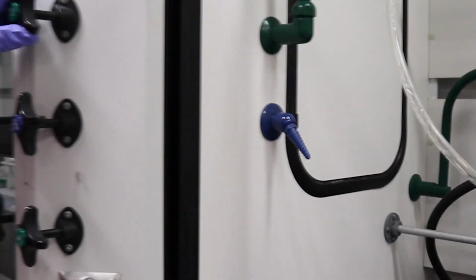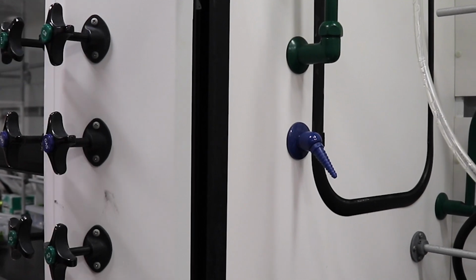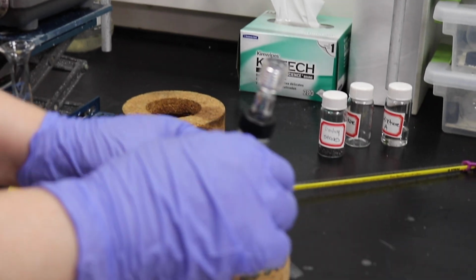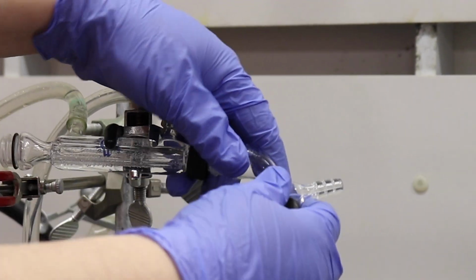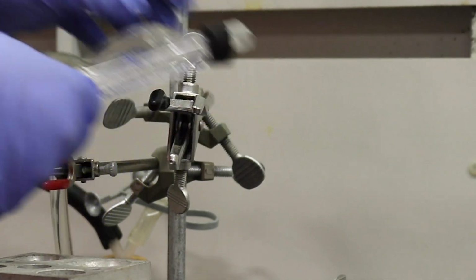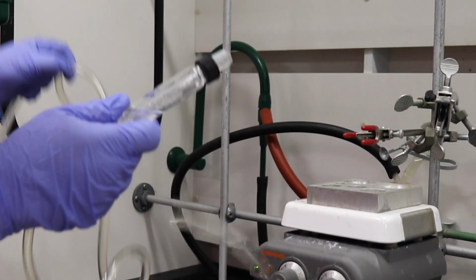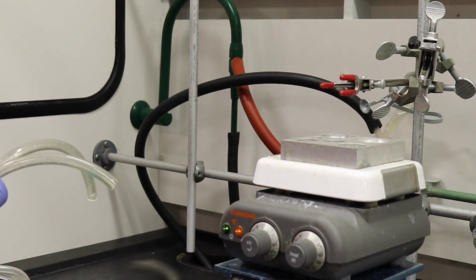Now we have to turn the water off and dismantle our apparatus. When we turn the water off, we take the thermometer out. We disassemble all the pieces. As you can see here, it doesn't really matter what order you disassemble the pieces, you just have to disassemble them. We're unclamping our condenser. We have to take off our tubing, being careful to make sure that the water in the tubing goes into the cup sink. We roll up our tubing, we take down our clamps.